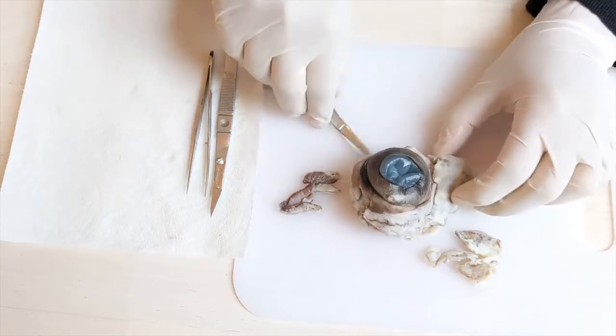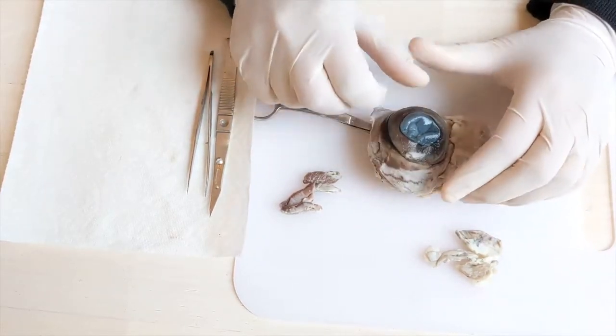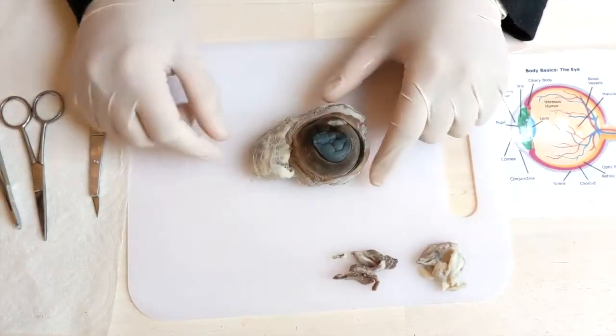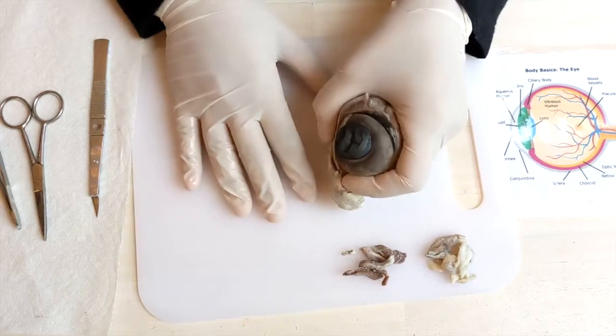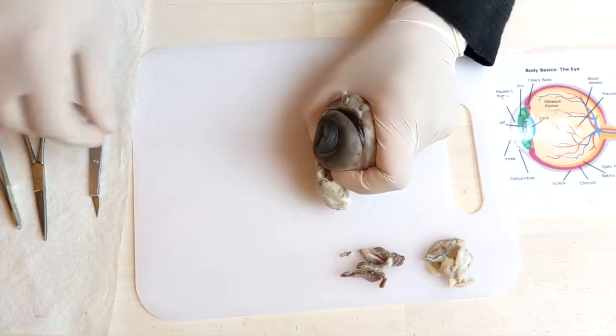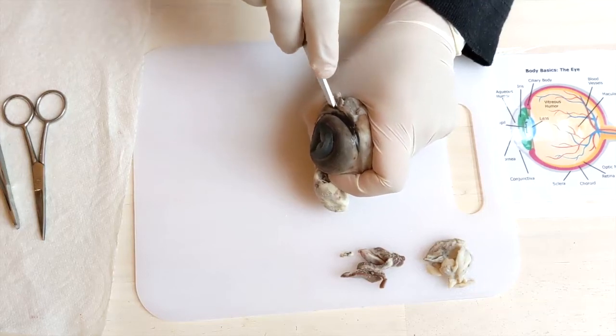All right, now I think we are ready to dig in and see what's inside the eye. I'm so excited. Okay, I think we're ready now to cut inside and see what's going on. In order to cut, you hold it like this, and then you make an incision here, like that.